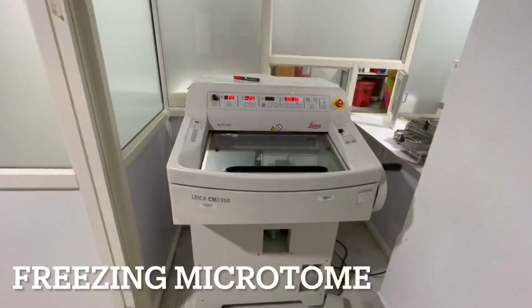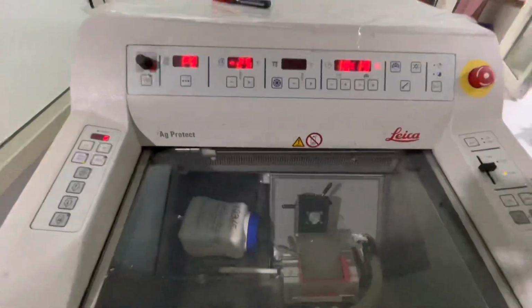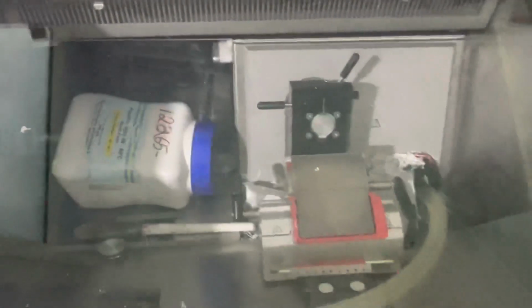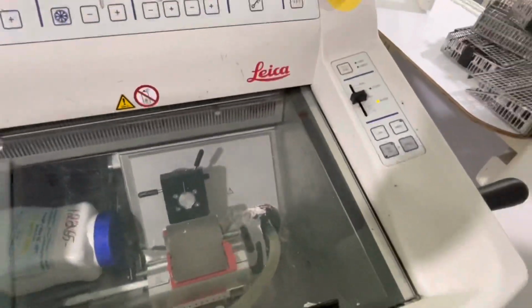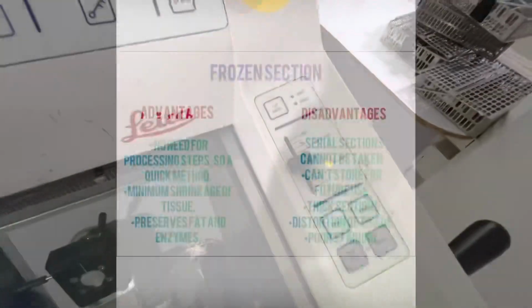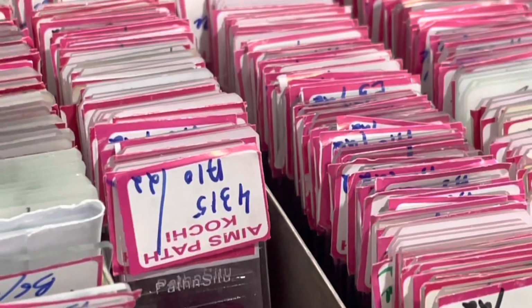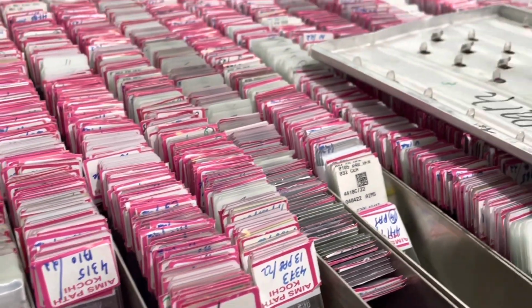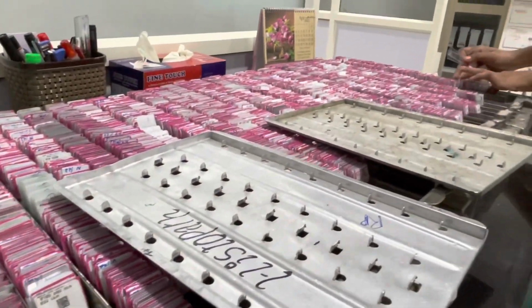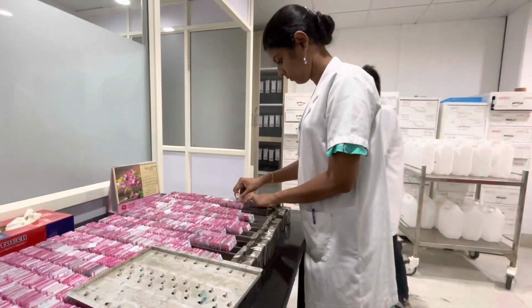This is a freezing microtome which is equipped with a stage upon which tissues can be quickly fixed. Once the tissue is fixed, it is frozen using either liquid carbon dioxide or liquid nitrogen. The frozen tissue is then cut into sections using this microtome. The prepared slides are then collected and taken for examination.